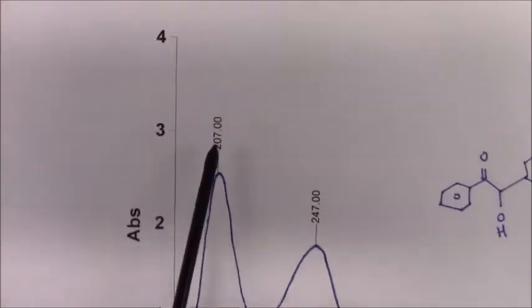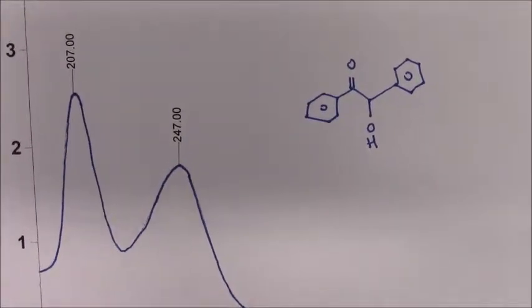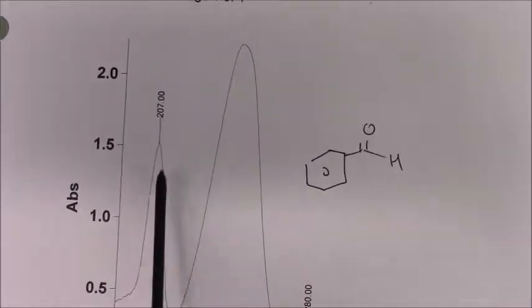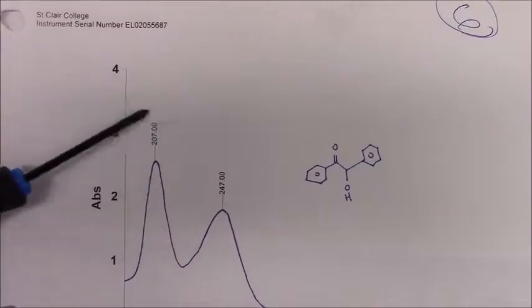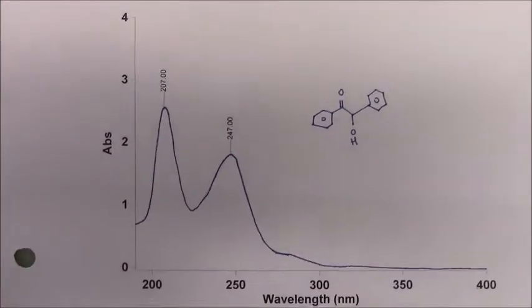So really, what is the difference? We had a number on the first hump, 207. This first one is 207. So the product is strangely going to look very, very similar, just like acetophenone. Now, some people could argue, when you look at this, typically the intensity of one peak versus the other normally stays even when you decrease the concentration, whereas the product, this one at 207, is more prominent than this one. So those heights typically stay in sync.